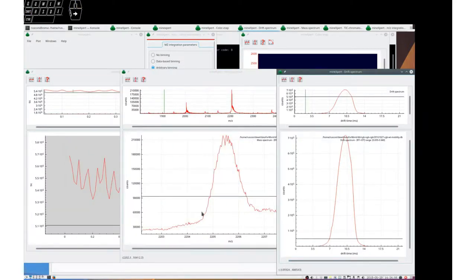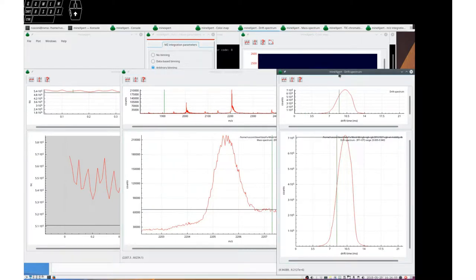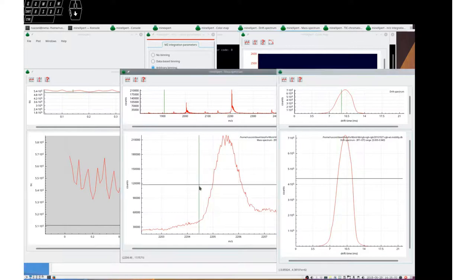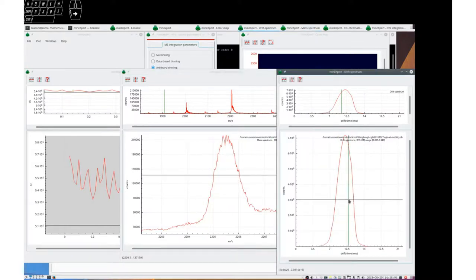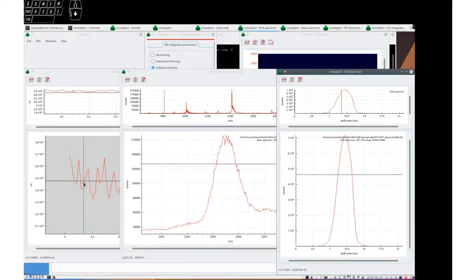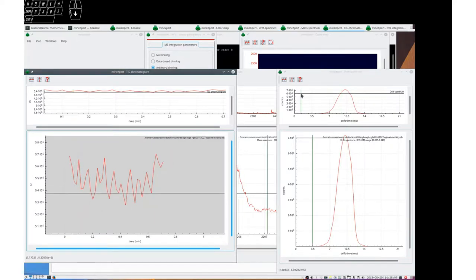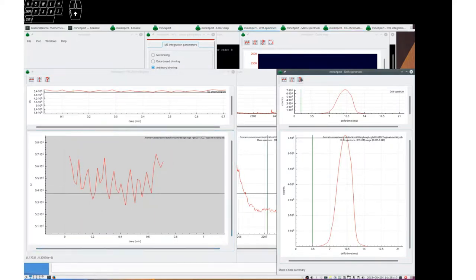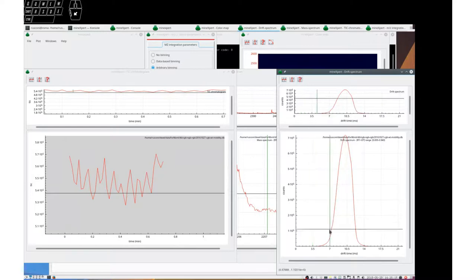It would be exactly the same here from the drift spectrum to either the mass spectrum or from the drift spectrum to the XIC chromatogram. Let's see the explanations. Press R to integrate to an XIC chromatogram. Let's do this.